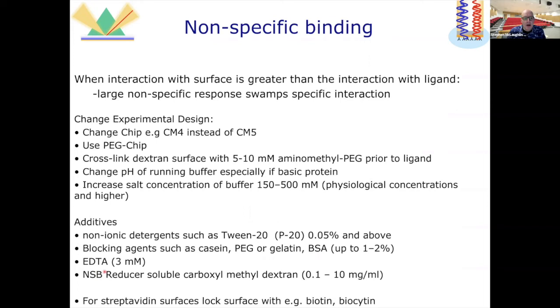Maybe EDTA might help. And Cytiva then sell a non-specific binding reducer, which is just soluble carboxymethyl dextran, and you add this in at this kind of concentration. For streptavidin chips, you could maybe block with biotin or biocytin.